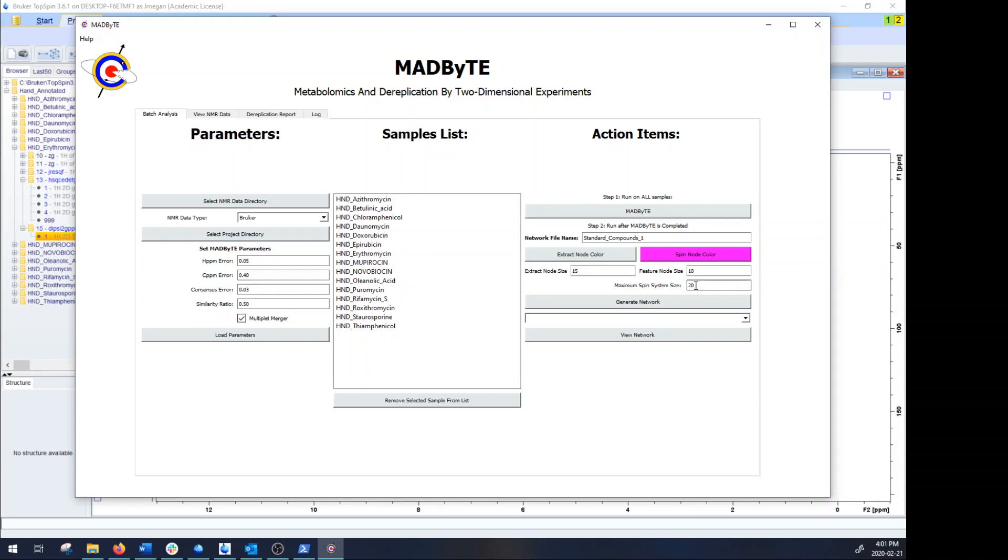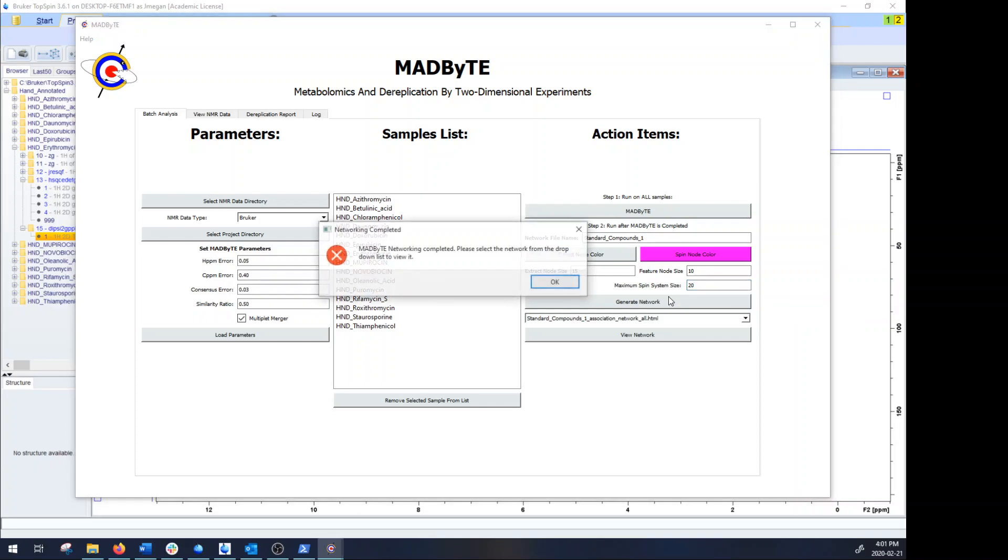So sometimes you would just go ahead and say all right, 20 members is a pretty long chain, that's a pretty large scaffold if it is real, so I feel like that's a good cutoff. And then once all of that is complete all you have to do is hit the generate network.